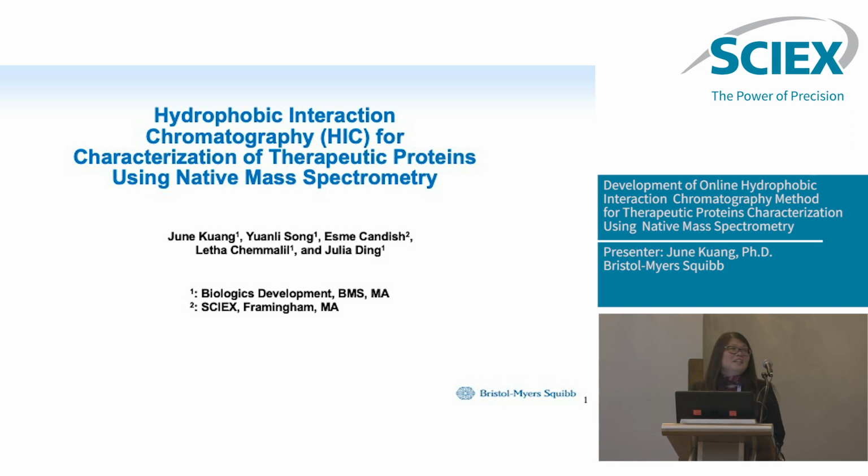Today, I'm going to present my work on hydrophobic interaction chromatography, or HIC, for characterization of therapeutic proteins using native mass spec.